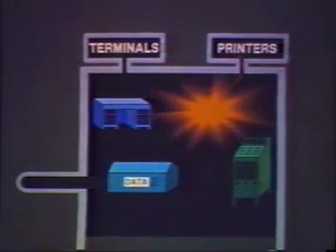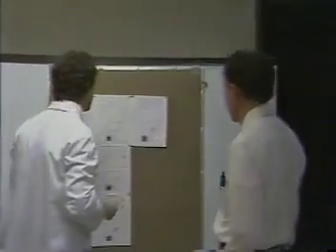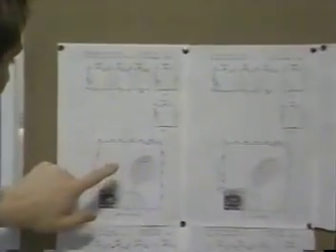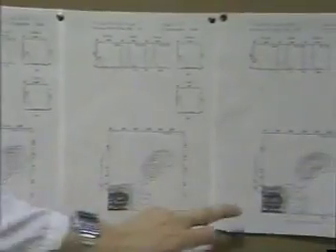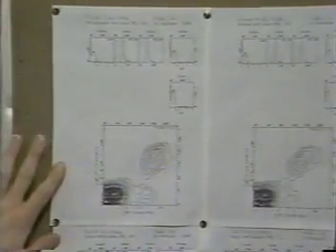Let's join Tom and Ken Alt one last time to see the results of the triplets experiment. Well, hi, Ken. This is great. What we have is the B-cell distribution patterns for each of the three triplets. And we can see that here's one of them, and the next, and the next. Very nice. And we have virtually identical patterns for their B-cells.